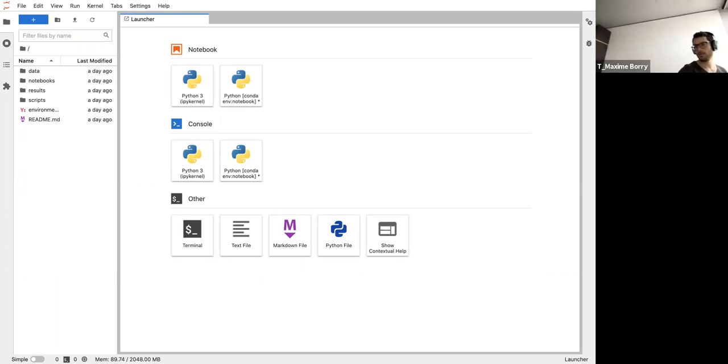All right. I think everyone has been able to load the binder. So welcome to Binder. Binder is actually a small Jupyter server. For those of you who have never heard of Jupyter, it's a program that allows you to run interactive, computational notebooks in your browser. And here you have a server that is provided by different cloud companies. Some of you might be on Google Cloud. Some of you might be on OVH. They provide this server for free. It's a small server, but it's for free.